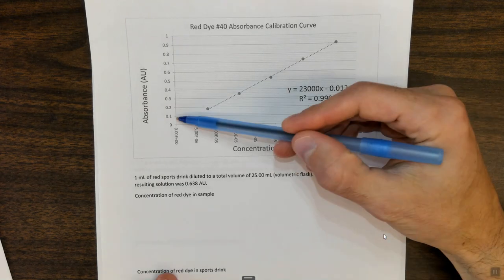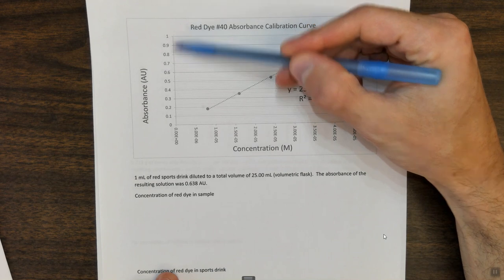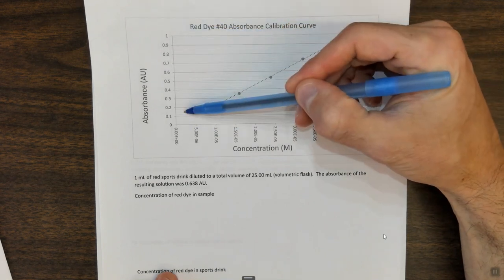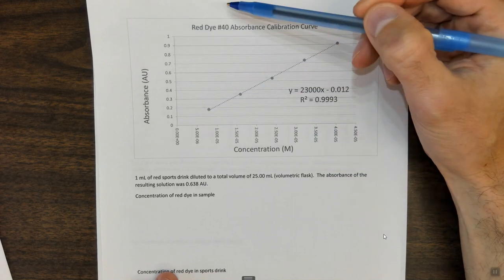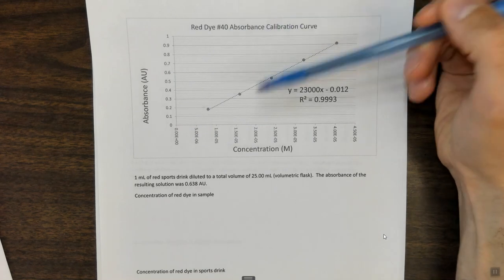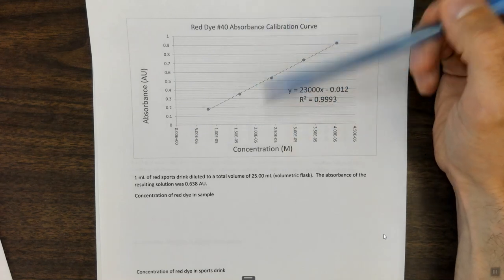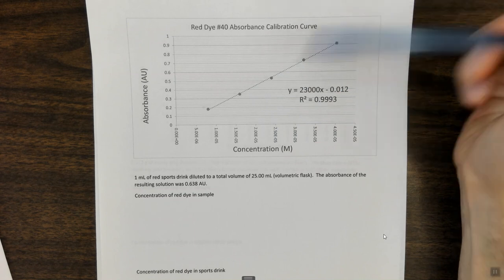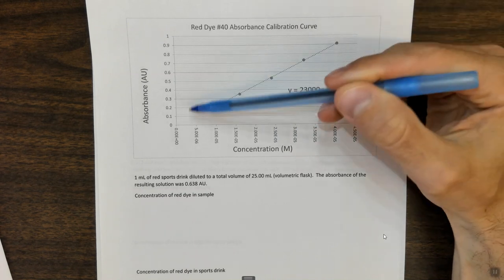Because your absorbance ranges are between 0.1 and 1, you can dilute by 10 times and be safe that you'll fall on the calibration curve. But if you have an absorbance around 2 in the instrument, that essentially means that you're just blocking the light, and it's very unlikely to be, actually, in the linear range. So meaning if you have an absorbance of 2 and you dilute it 10 times, it's not going to become an absorbance of 0.2.